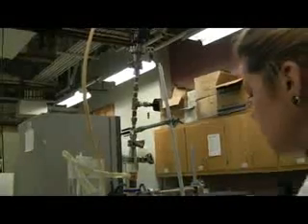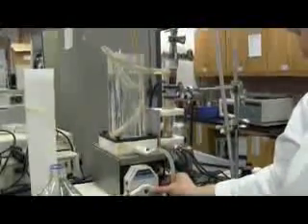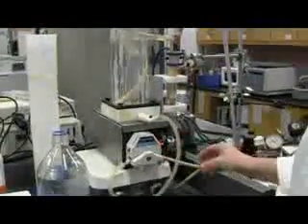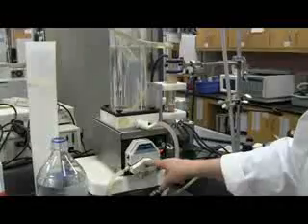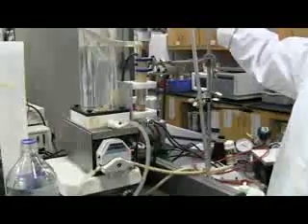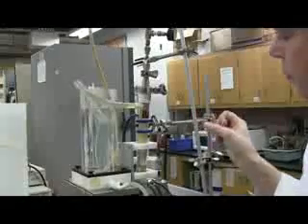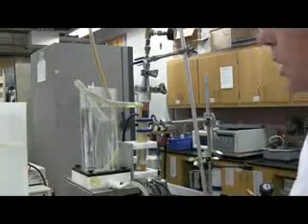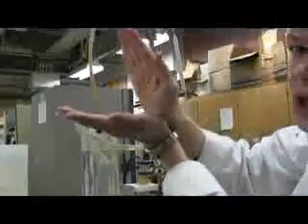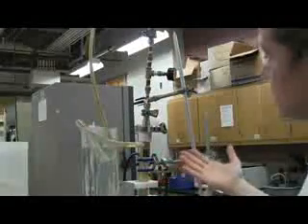All right? So what we're going to do now is turn the pump on. And believe it or not, we're going to press it to reverse. That's just the way it's going to be. We're going to press it to reverse because that's going to make the little guy go that way. And now we are going to have some flow through here. Now the pressure gauge is not all that easy to read, but basically it's a peristaltic pump, so the pressure is fluctuating. So the pressure you want to read off the gauge is the highest. It reads a range, and the high value is the actual pressure being applied across that membrane.